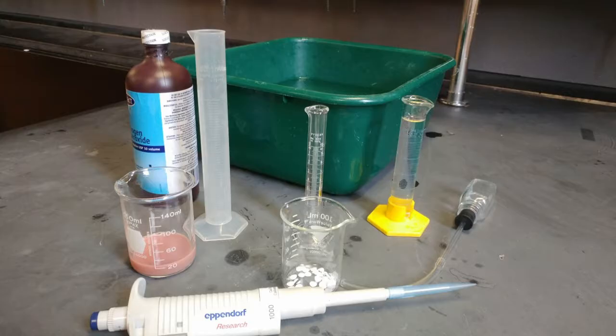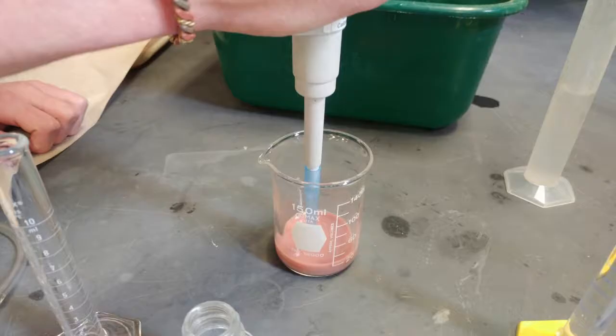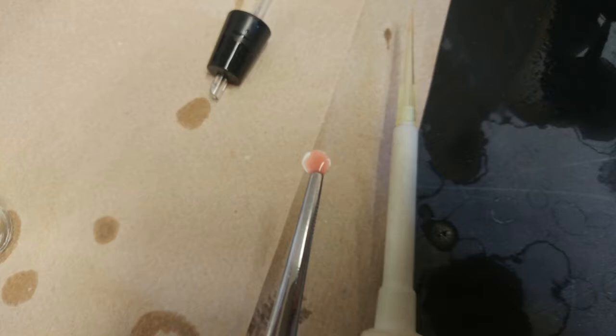For our procedure, we made sure to have 10 milliliters of solution for all dilutions and used a baseline concentration of 3% hydrogen peroxide to make all dilutions. For the 2.4% concentration, 8 milliliters of hydrogen peroxide was mixed with 2 milliliters of water for a total of 10 milliliters. For every greater diluted solution, 2 milliliters less of hydrogen peroxide was used and 2 milliliters more of water, until we got to 0% where the 10 milliliter solution was only water. For the catalase, we pipetted 40 microliters onto a paper disc. The baseline procedure was then followed.